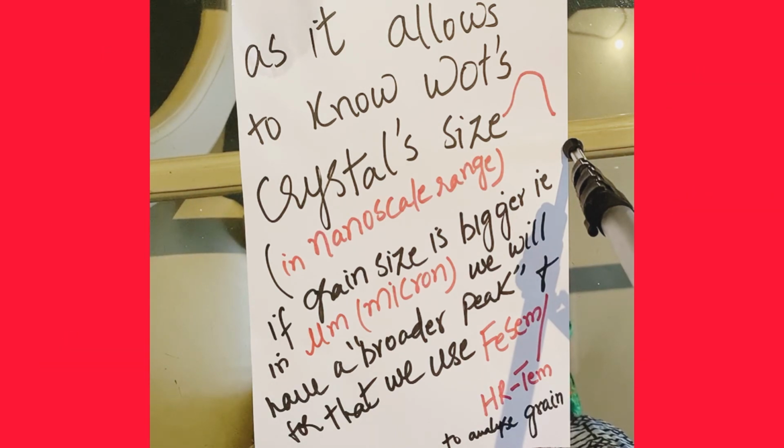You will get knowledge from other sources. You will compare these slides with your own books, and then try to memorize and learn more about this topic, that is how you can measure FWHM.